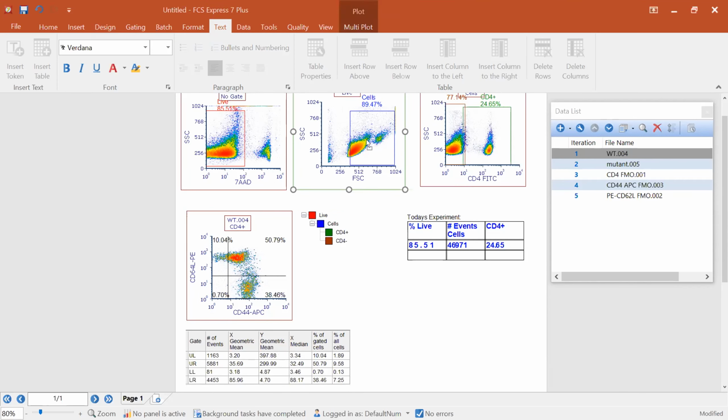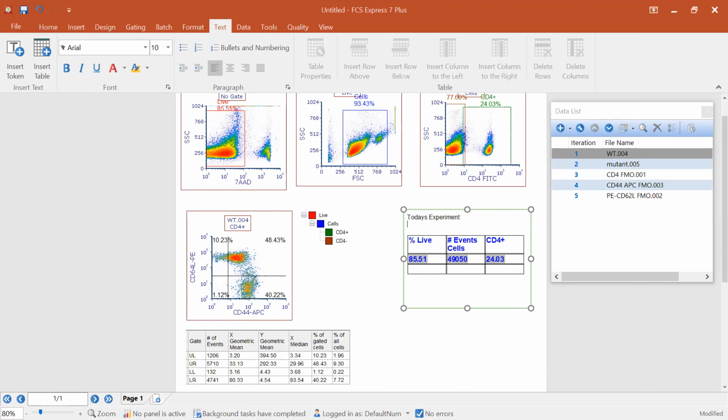Now, the other thing that we can do in FCS Express is we know that there's information associated with this experiment, like the day that you acquired the data, who acquired the data, what keywords you typed in, what the sample ID was in DIVA, and things like that. Well, that's all really important information that we don't want you to have to be moving between your lab notebook, experiment data files and things like that, especially if it's within the data file itself.